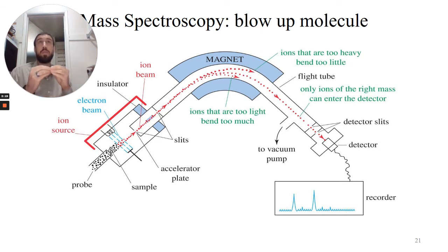When we're looking at those pieces that explode apart, they're typically charged. And so what the magnet will do is help sort out weird charged species so that the particles that end up making it to the detector have a very particular charge, and in this case, a +1. Okay? So what this is going to do is give us an output that relates the mass of the particle to the charge. But since the charge is always +1, our particles are coming out as just their mass. So that distance traveled helps to sort those out.